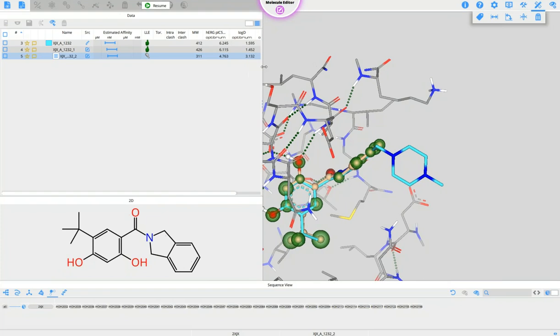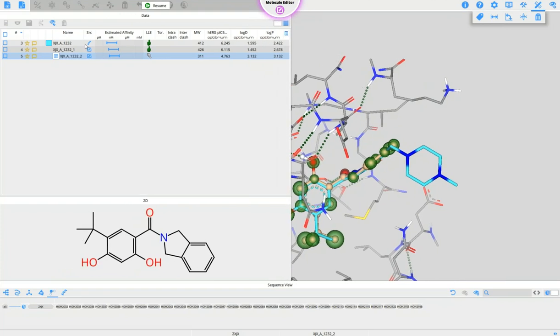If I look at this, I see, of course, I've not changed much my binding affinity, but I've of course changed, for example, log D drastically. Equally, I've lowered the hERG pIC50, so you see you can do some good multi-parameter optimizations from here whilst you're designing new compounds, find out a little bit more about your ADME properties and the physicochemical changes you're making to your molecule here.